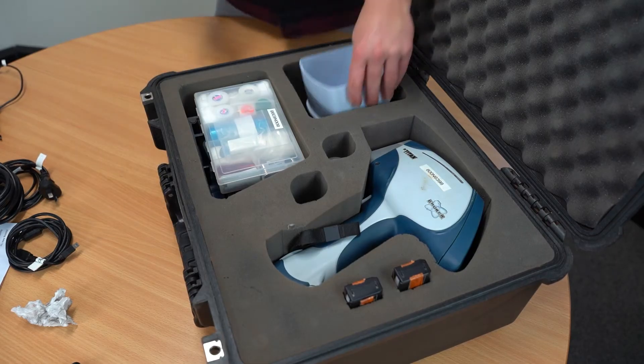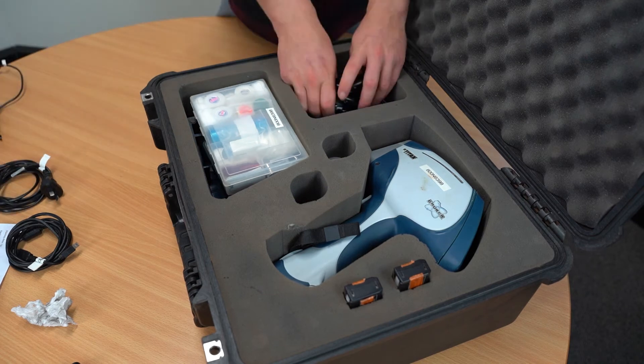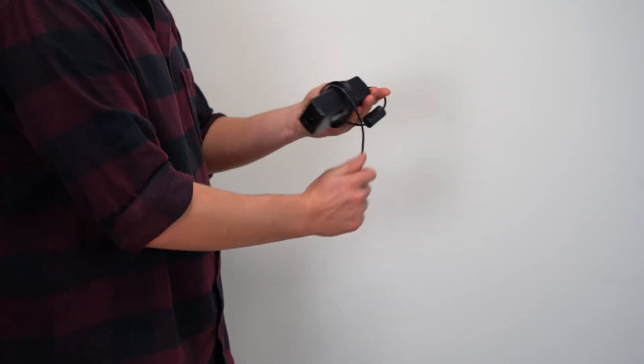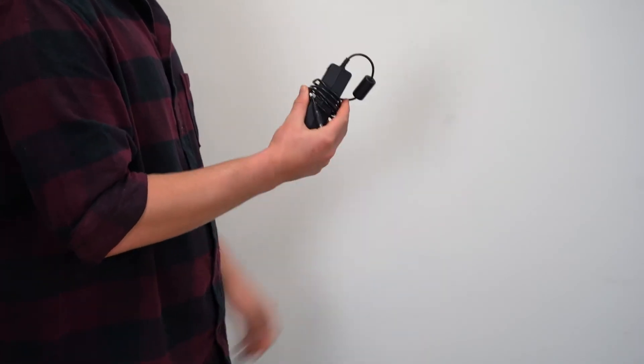Now for the other foam spot. Start with the lid of the stand, followed by the wrapped up cords. A trick we like to do is to roll them up like this — not super tight and the ends not bent on the power pad — so that the cords will last longer.